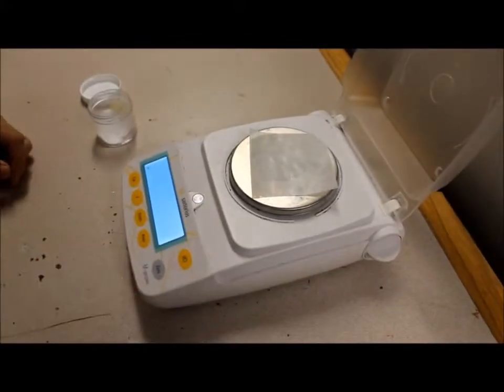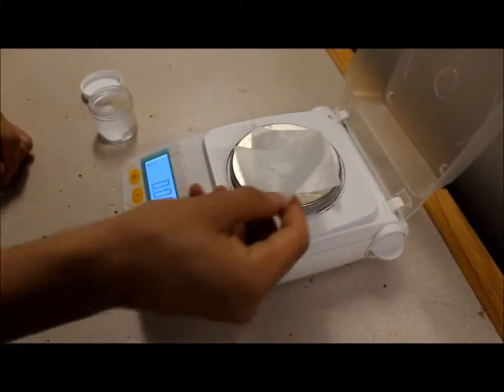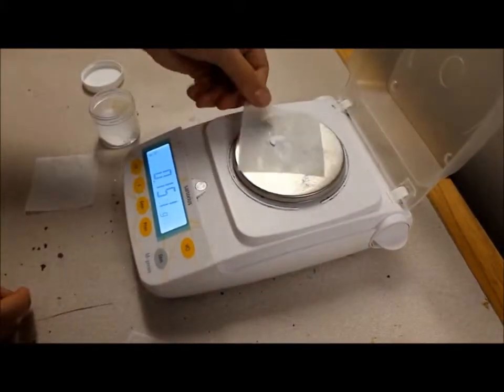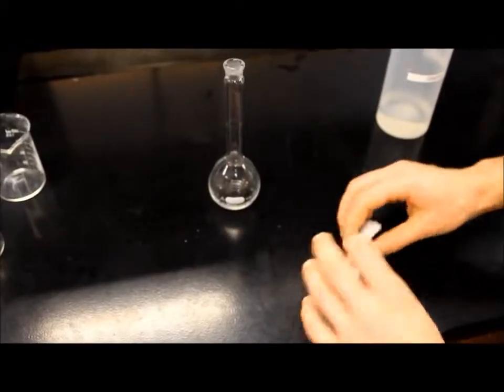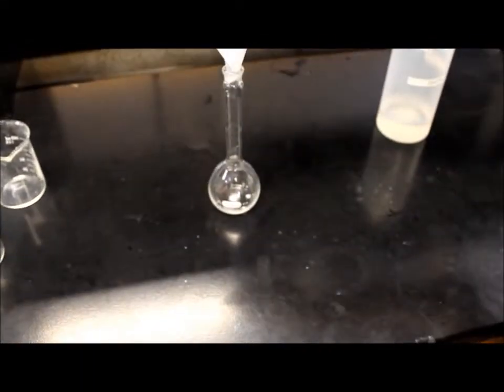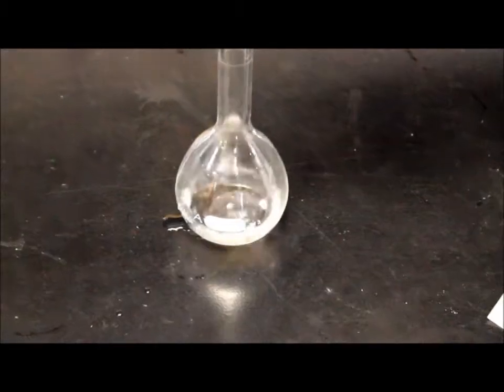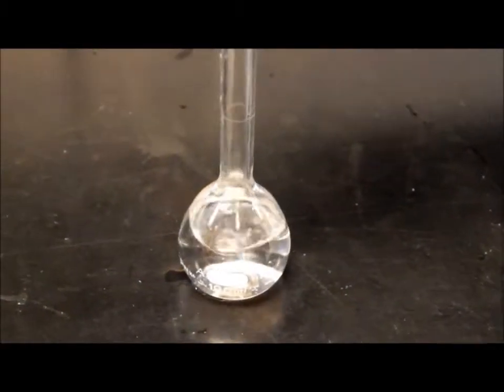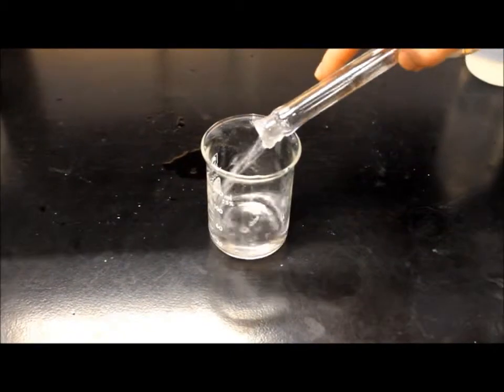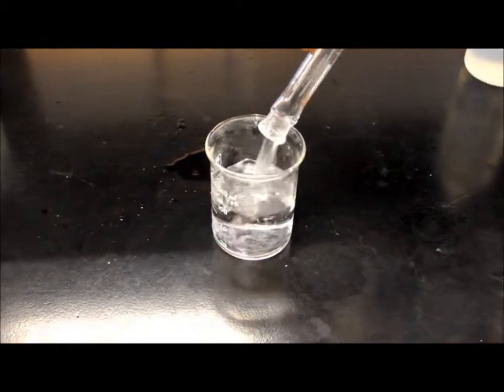Meanwhile, student B must prepare a 0.008 molar solution of sodium metabisulfite by weighing out roughly 0.15 grams, recording the exact mass, and mixing it with distilled water in the 100 milliliter flask filled to the line. Pour the solution into the 150 milliliter beaker.